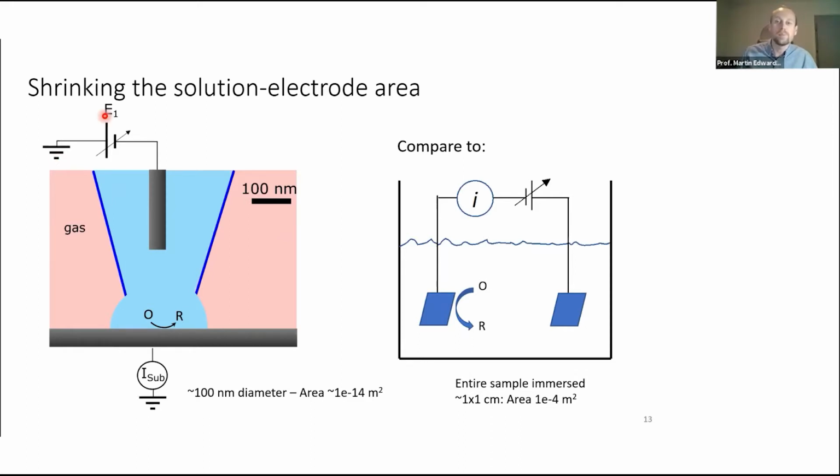If you look, we're controlling the voltage in both cases, measuring the current. Okay, I've labeled it slightly differently. Still got the same processes going on. We've got this area acts as the same as this whole electrode, and then this wire stuck in there acts as the other electrode. And really nothing else is different. And so this, to an electrochemist, is just a very weird shaped cell, but it allows people to do the same electrochemical characterization they've always been doing.